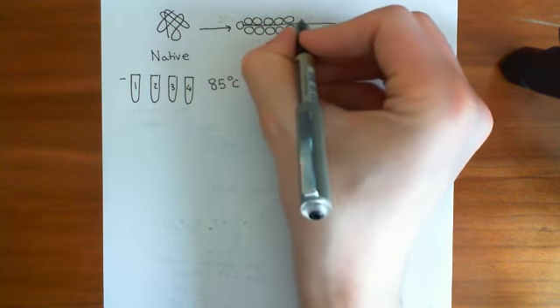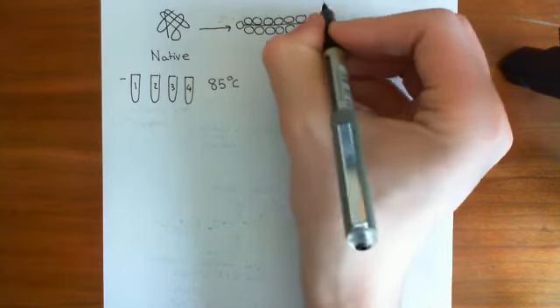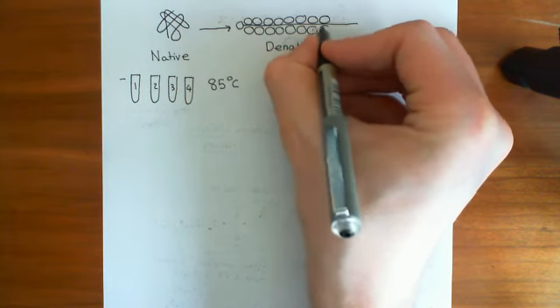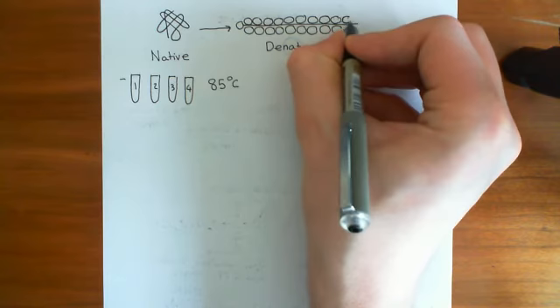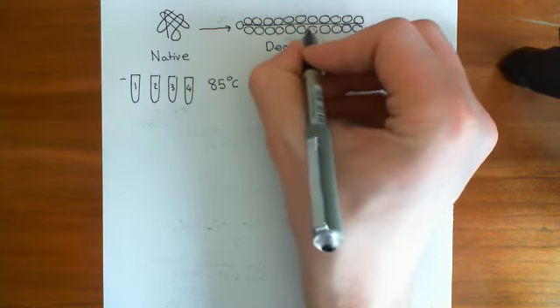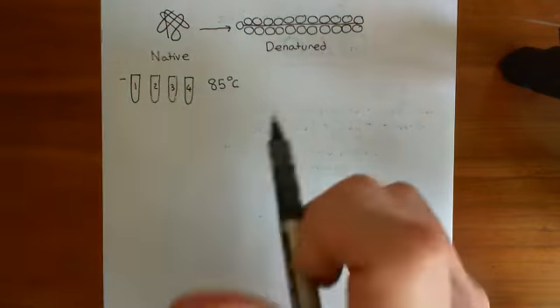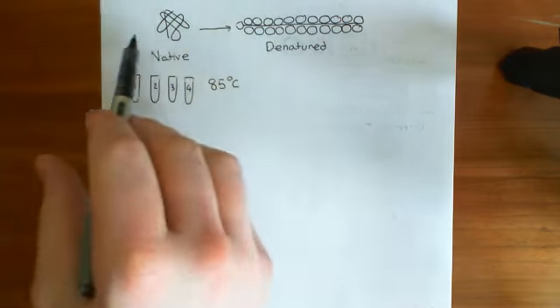Okay, so once you dissolve sodium dodecyl sulfate or lithium dodecyl sulfate, what happens is the two ions, the cation, which is the sodium or the lithium, and the anion, which is the dodecyl sulfate anion, separate from one another. And the dodecyl sulfate anions then surround the linear polypeptide like so. And they are going to stop it from ever being able to return to its native state.